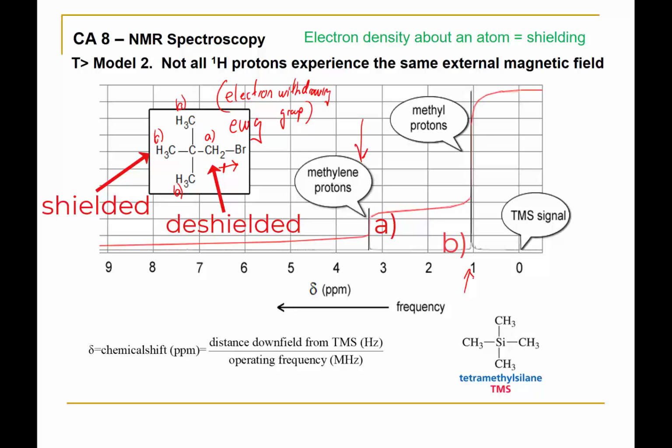Why it is not shown as an absolute value is because different NMR instruments use different size magnets, and will therefore require different radio frequencies to have the shift from the alpha to the beta state. In order for chemists to be able to compare spectra done on different NMR instruments, this is shown as a relative ratio compared to the operating frequency. The operating frequency will depend on the size of the magnet used in the NMR.